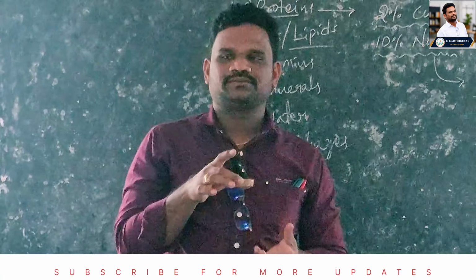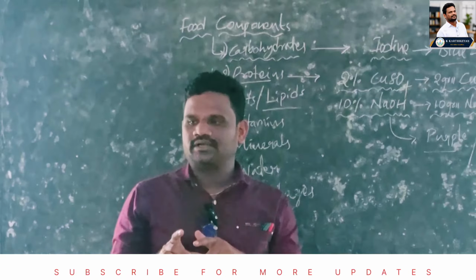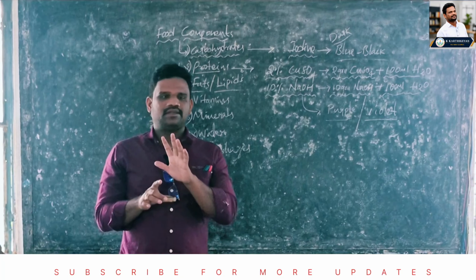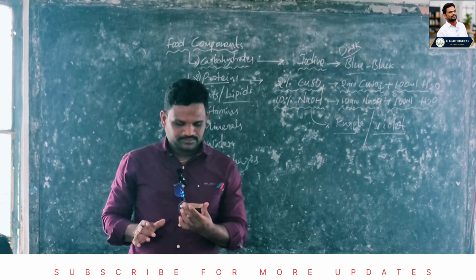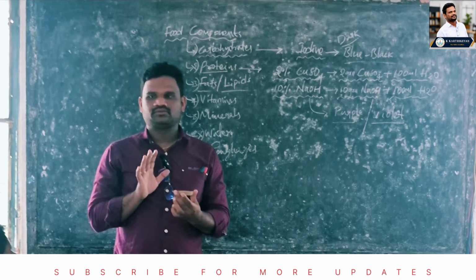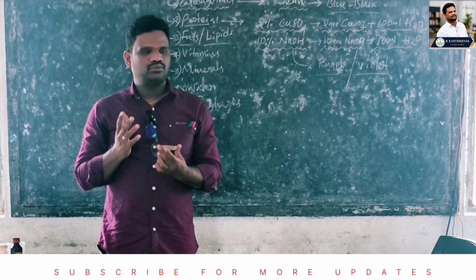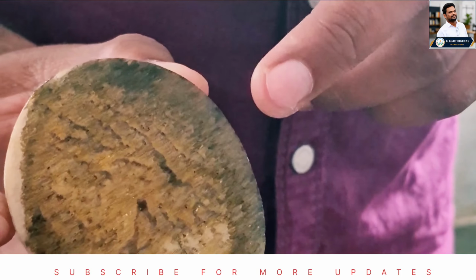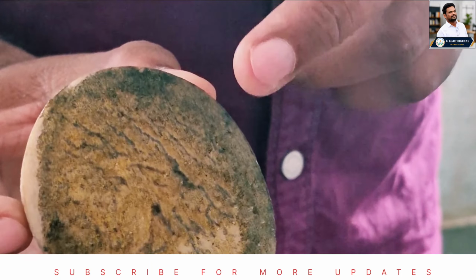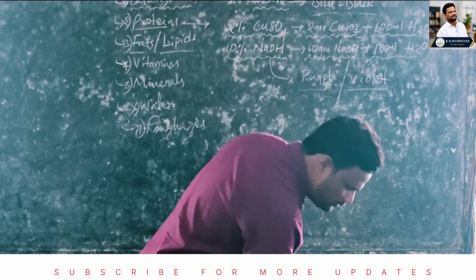Okay? After reaction, iodine reacts with which material of a food? Carbohydrates. Which means if carbohydrates react with the iodine, it converts into dark blue or black color. Okay, now already 10 to 20 seconds are over. Now let us see how carbohydrates are converted into blue or black color. Okay? Come closer. See this color. Like this, carbohydrates are converted into dark blue color with the action of iodine. Okay? This is the confirmation test for what? Carbohydrates.